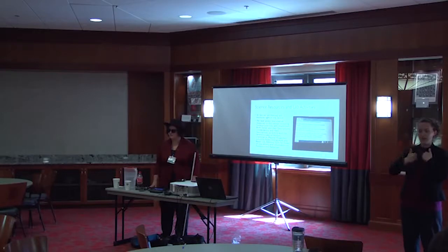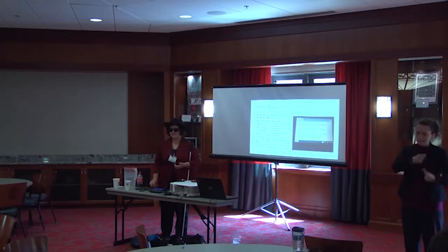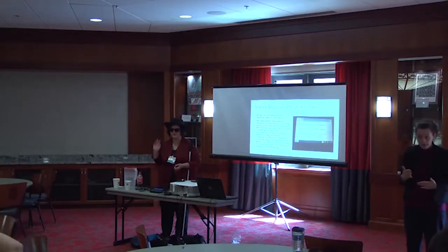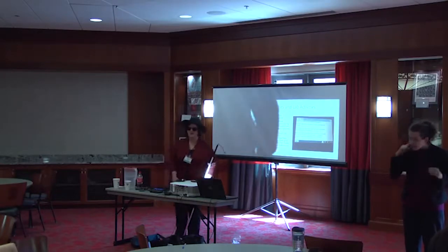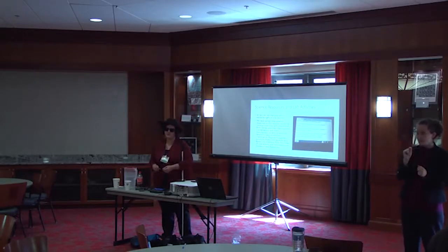And then we have on here, C1. Temperatura 20,3 grados Celsius. So now we have it announcing in Spanish. Temperatura 20,4 grados Celsius. And if you're visual, you'll notice it changed to a comma instead of a decimal point, which is the common aspect for Spain. So in parts of the world that a comma is used instead of a period, it changes for that as well.